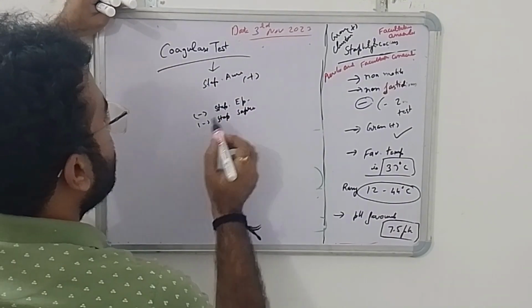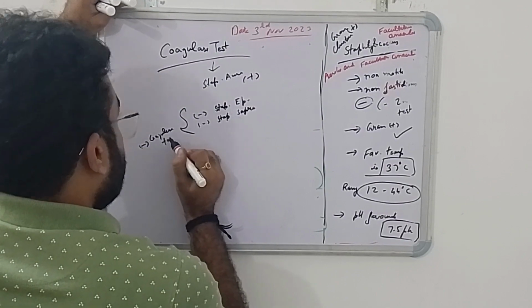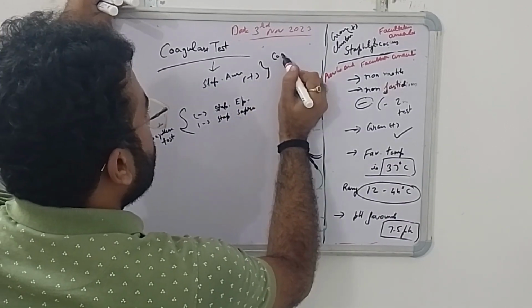These are coagulase test negative, and these are coagulase test positive.